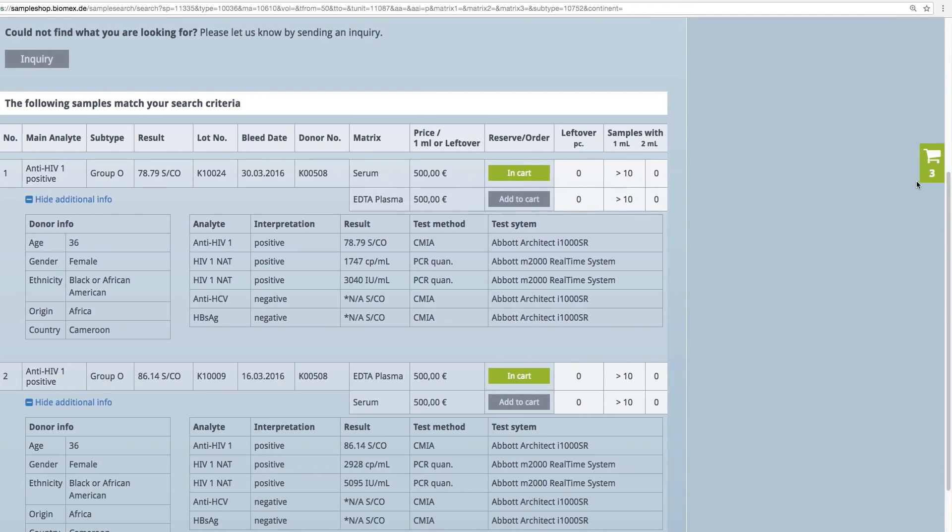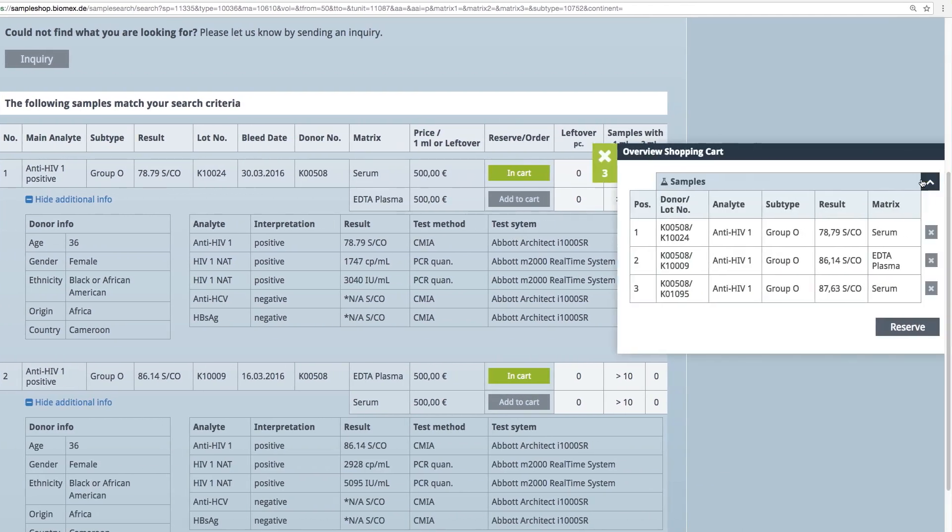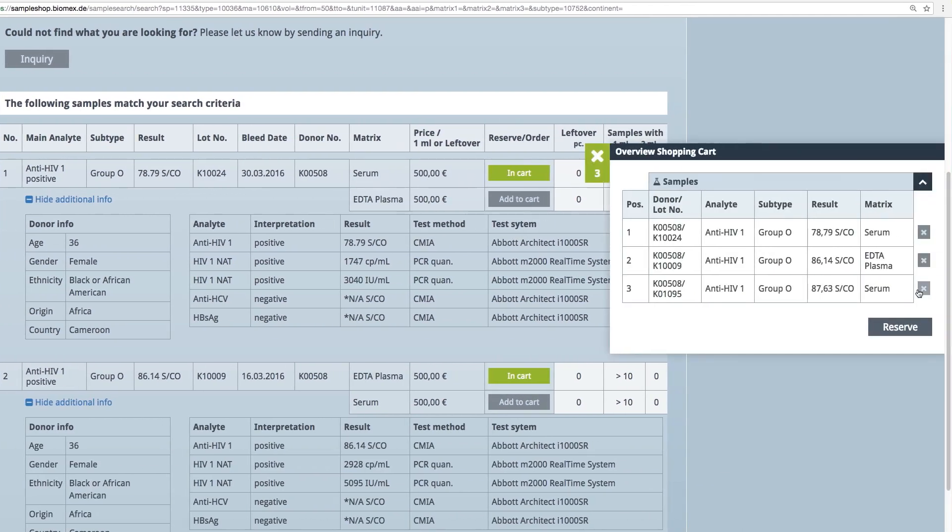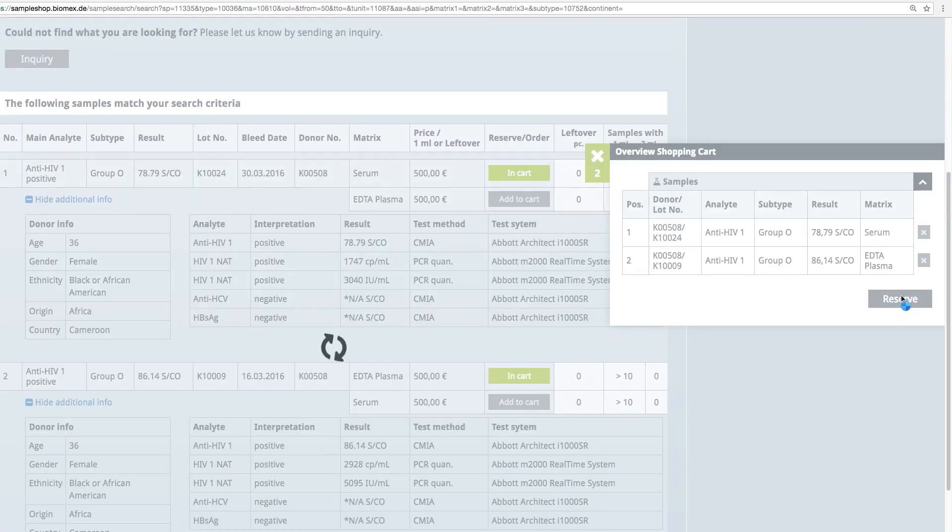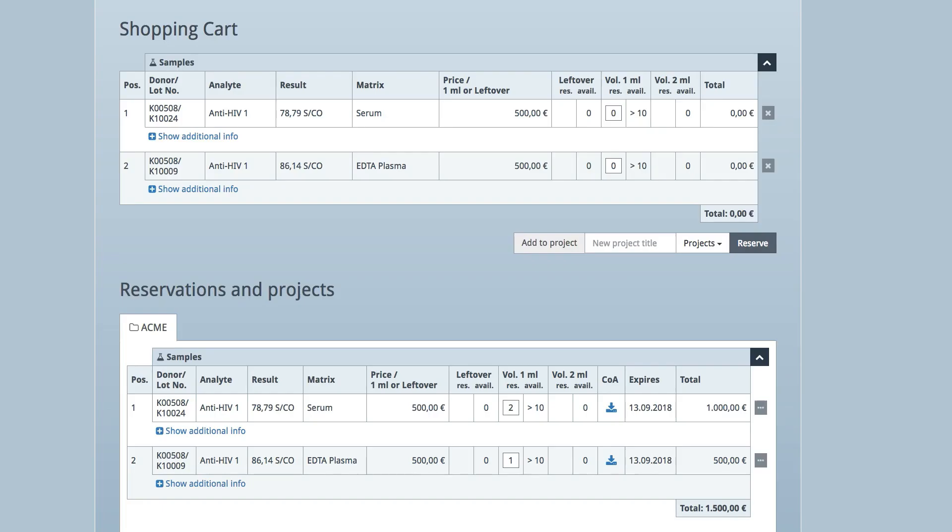Remove samples by selecting the X on the right hand side or click on Reserve to receive an overview of your shopping cart.